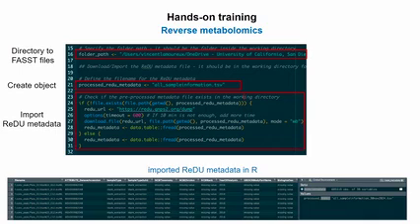So how many of you did get the 3 files now? Is this more than 10? Please raise your hand, because otherwise there's no way I can know if I can proceed or not. Okay, just a few of you still. Maybe it's an internet problem. Who still has an internet problem? You? Okay. I can go slowly through the different steps.